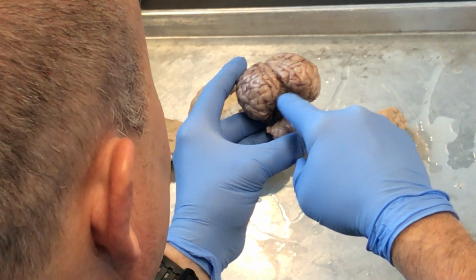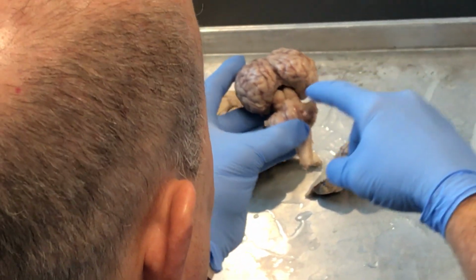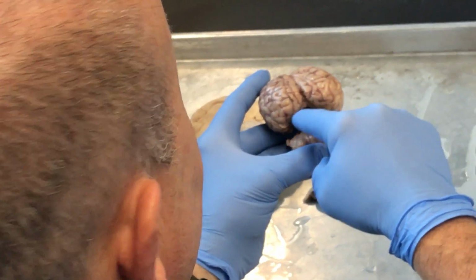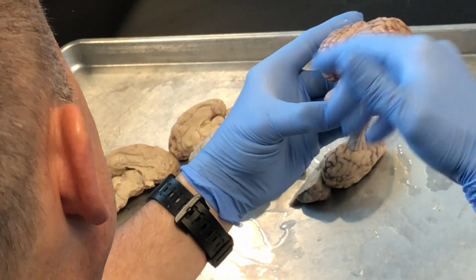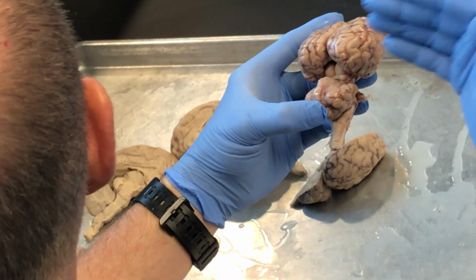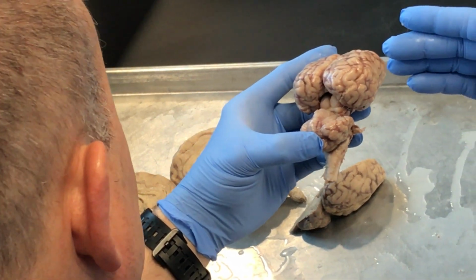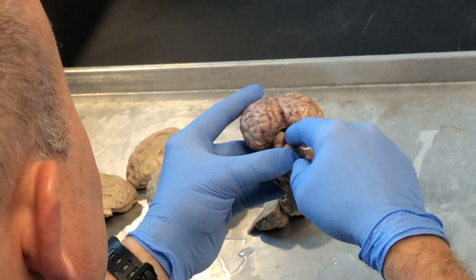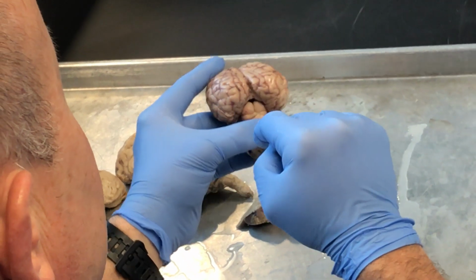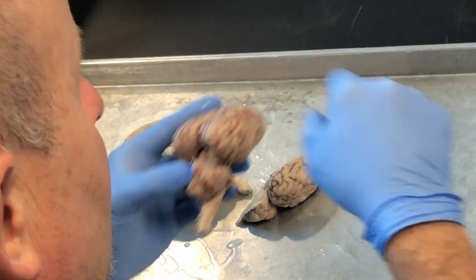The superior colliculi are involved in that reflex of actually, before you ever really know what's going on, protecting yourself. So the superior colliculi are involved in that sight reflex, seeing the shadow, and the inferior colliculi are involved in the hearing reflex, hearing him yell whatever he yells at you. Okay? We'll talk about the tectospinal reflex a little bit later on. But that's the corpora quadrigemina, the two superior and inferior colliculi. Superior larger.